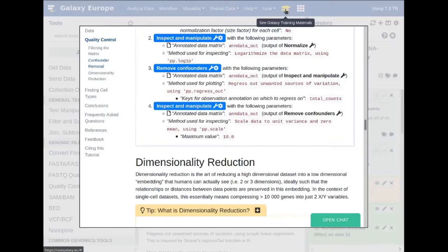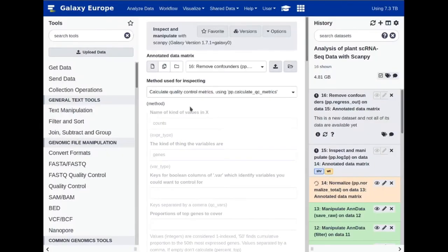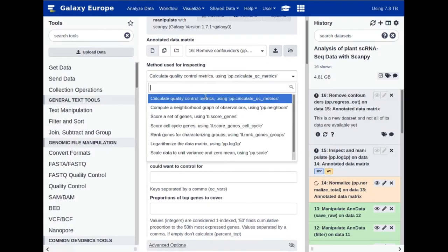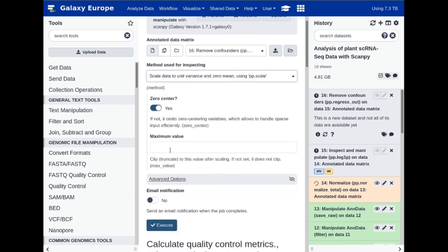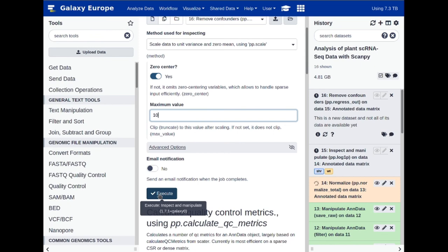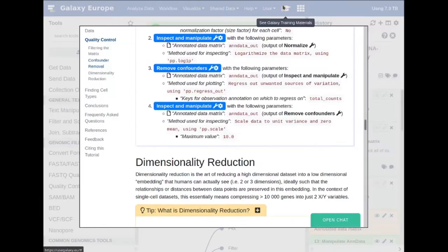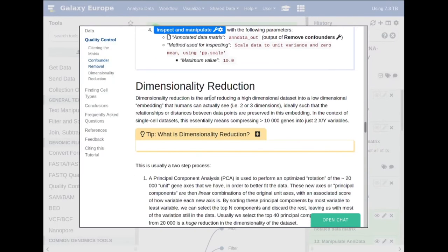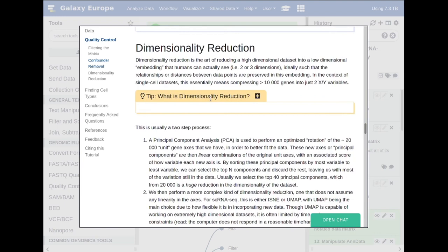We also wish to scale the data to unit variance. This ensures that the mean expression of a gene is not the contributing factor — it is more the variability of the gene that we care about. We are now looking at gene dispersion rather than absolute gene expression. By doing this we should have a much nicer dataset to use for dimension reduction.